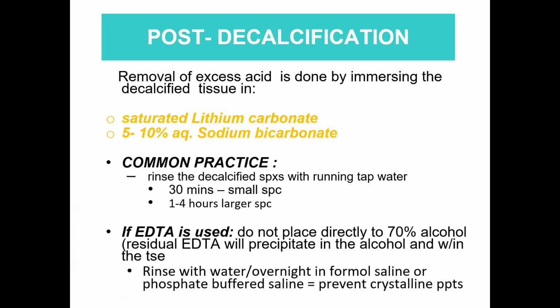Post-decalcification is the removal of excess acid by immersing your decalcified tissue in saturated lithium carbonate or 5 to 10% aqueous sodium bicarbonate. The common practice is to rinse the decalcified specimens with running tap water, approximately 30 minutes for small specimens and 1 to 4 hours for larger specimens.